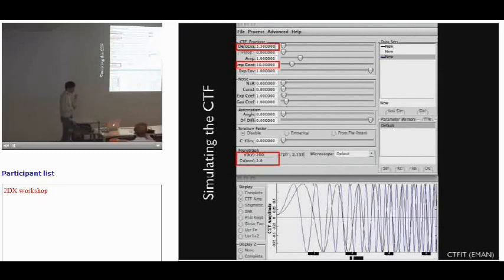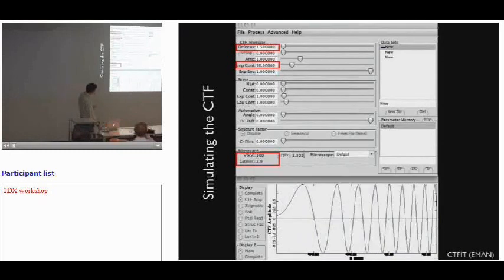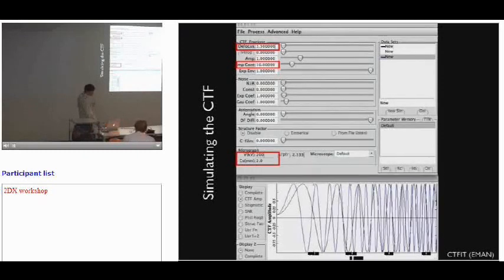If you only collected one image at a particular defocus, of course you run into a problem that at this point you don't have any information. But you can recover that information by collecting complementary images at different defocus where you result in an overlap, and in this way you can come to a more or less complete reconstruction with complete information content.